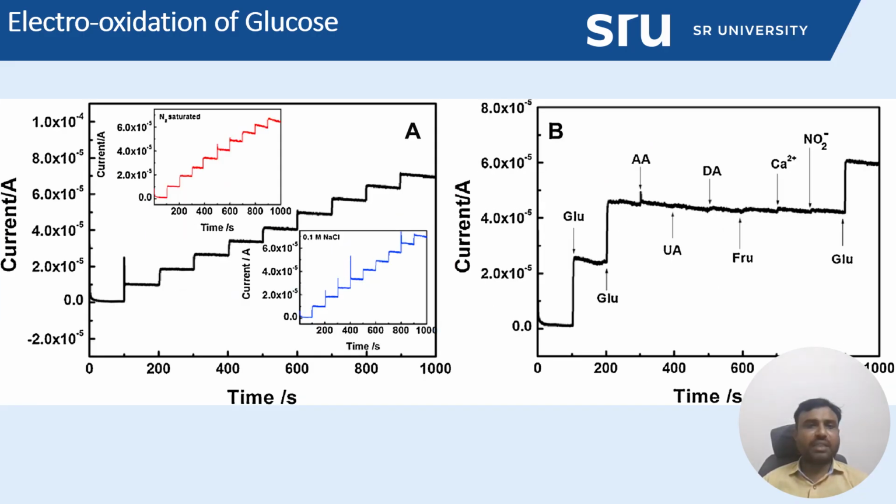So in this lecture we are now seeing the different conditions for the electrooxidation of glucose using the same copper sulfide microflower modified electrode. Because in real sample detection, our blood contains different constituents, different biomolecules and metal ions, it is essential to detect the glucose concentration in various environments. For example, we have measured glucose detection under different conditions at the copper sulfide modified electrode surface.